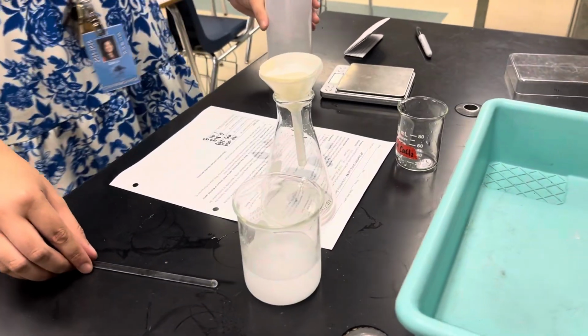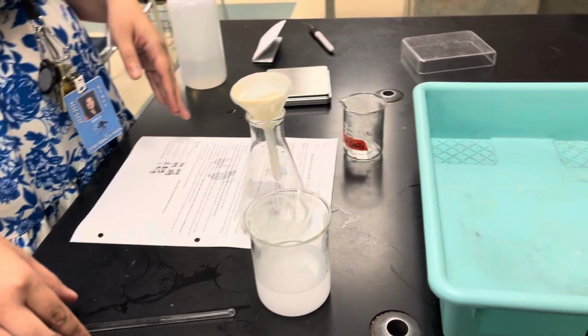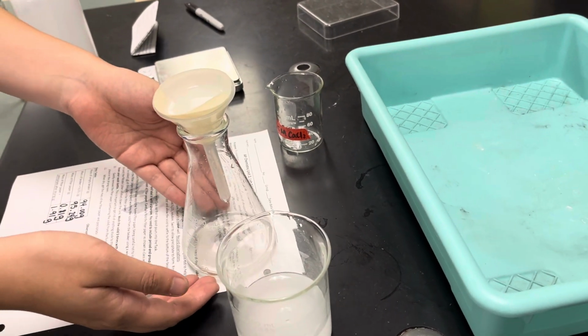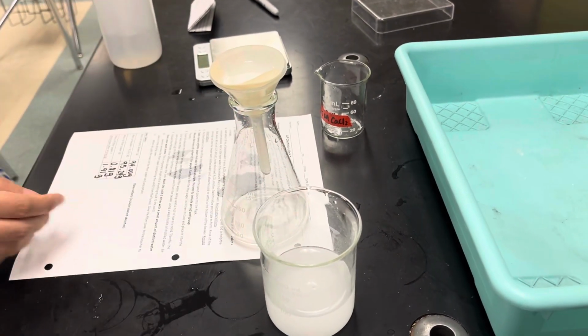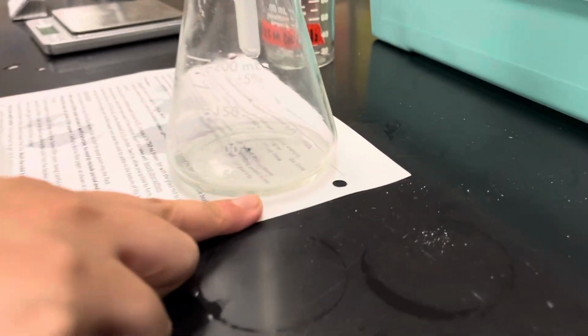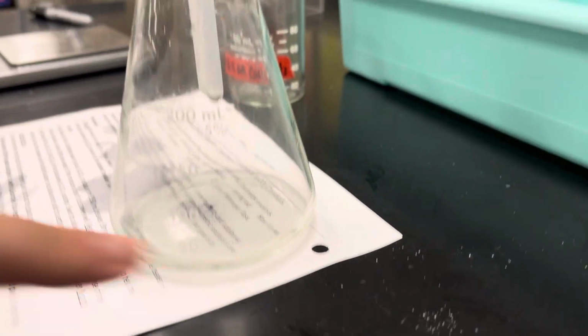Another common mistake that people make is if they don't filter it correctly and some of the precipitate gets into the flask, then they will lose some of their chalk, all right? So we are doing pretty good so far. We can see that it is totally colorless down here and all the white stuff is sticking on the top, right?